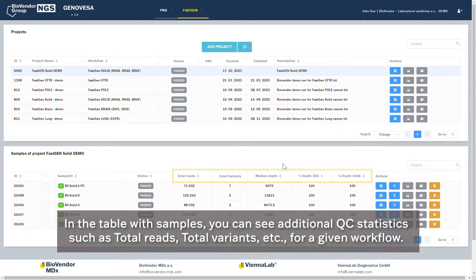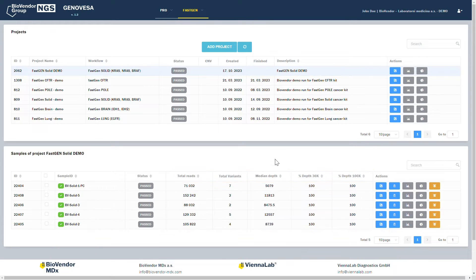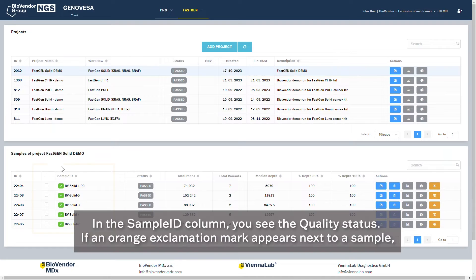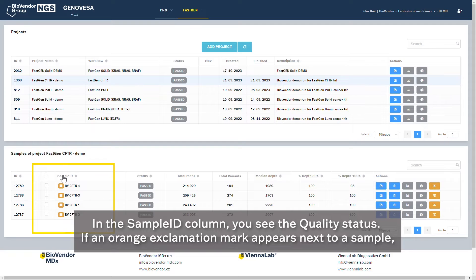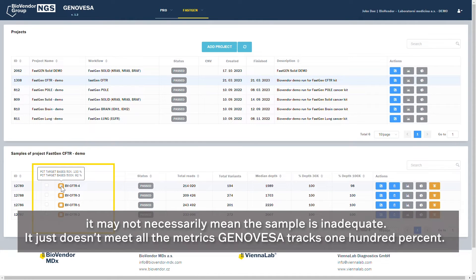In the table with samples, you can see additional QC statistics such as total reads, total variants, etc., for a given workflow. In the Sample ID column, you see the quality status. If an orange exclamation mark appears next to a sample, it may not necessarily mean the sample is inadequate — it just doesn't meet all the metrics Genovesa tracks 100%.